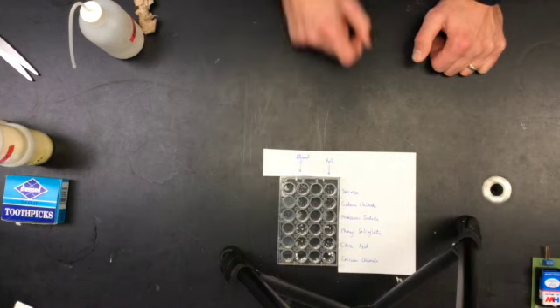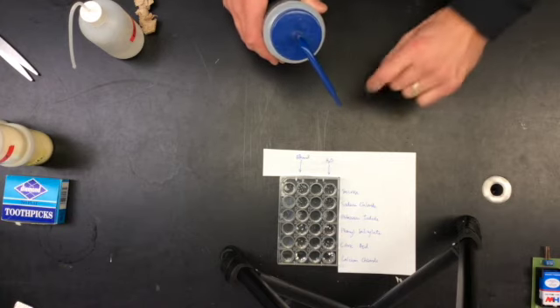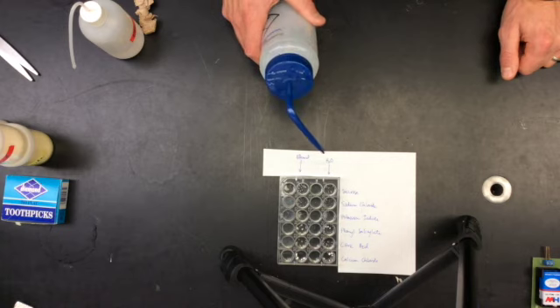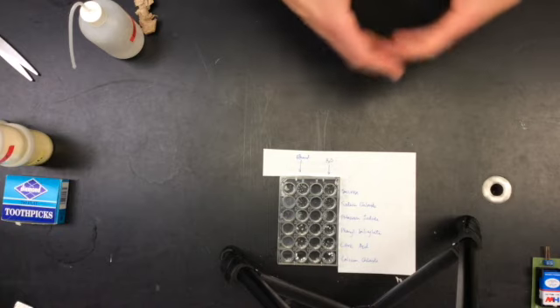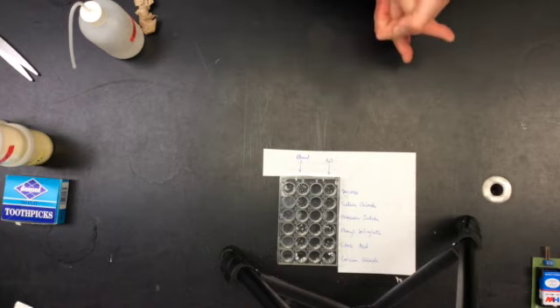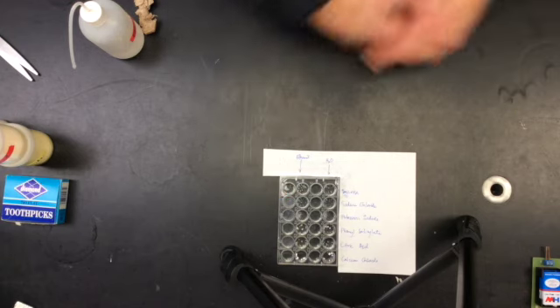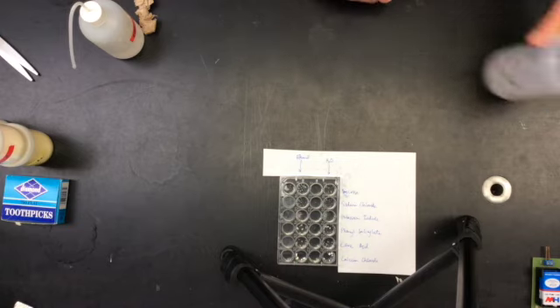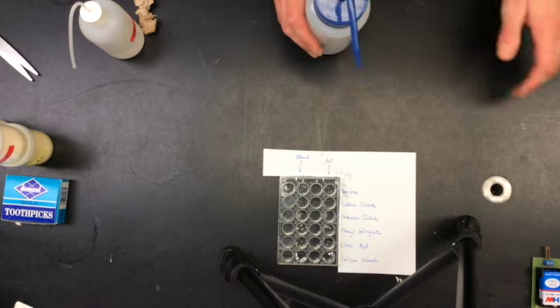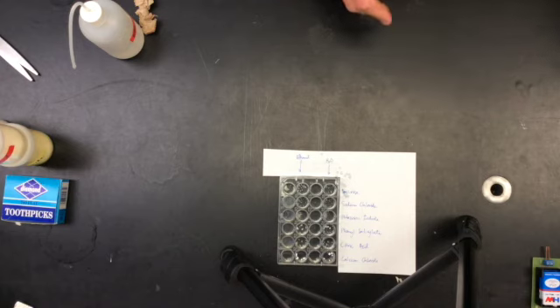In this column, I'm going to add 10 drops of water to each of the wells, and we'll observe what happens to our compound in that well, if it dissolves or does not dissolve. And in this column, I'm going to add 10 drops of ethanol. As you may have noticed, when I went to add some deionized water, my bottle just simply started squirting. So I'm going to go run and grab another bottle real quickly, and then we'll begin.